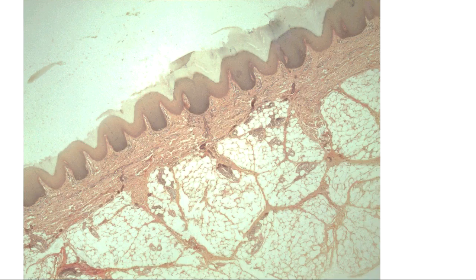Now, when we look at the parts of the skin, there is a note in your packet that we not only have the parts we've talked about, so let's list the parts we've talked about. We talked about the epidermis, we talked about the papillary layer of the dermis. We talked about the reticular layer of the dermis. There's one other layer that we couldn't see on our other slides that we can see on this one, which is why I included it.